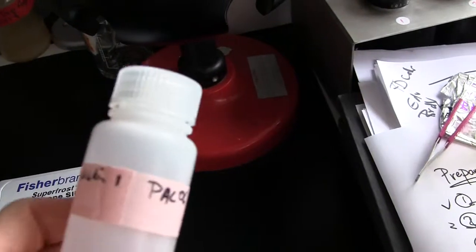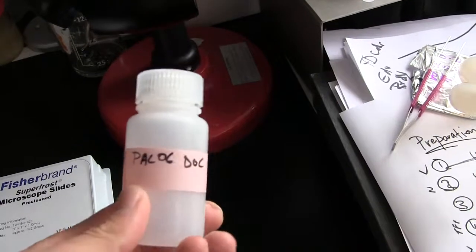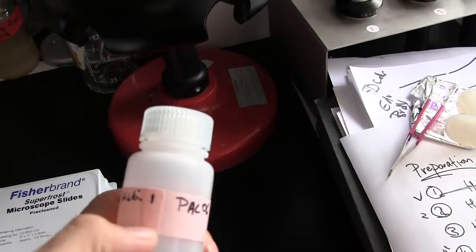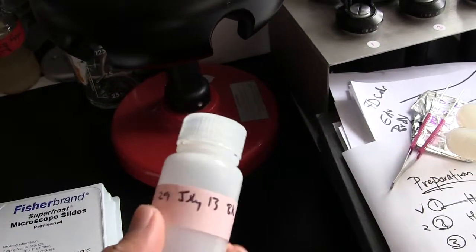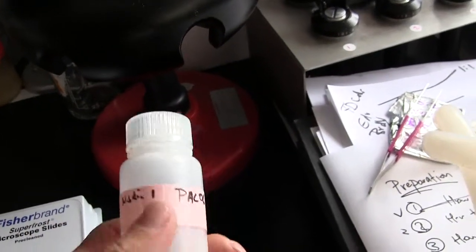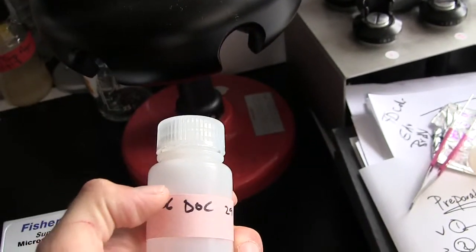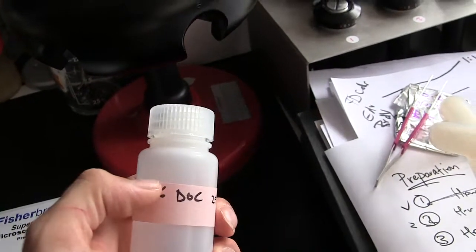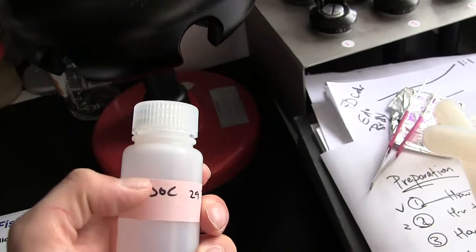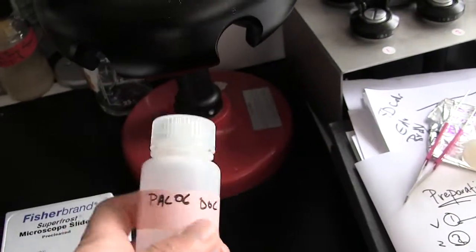Alright, so first of all, this is a DOC sample. It comes in a large wide mouth high density polyethylene HDPE bottle. You'll see that I've labeled it by placing lab tape all the way around it, so it comes back and loops onto itself, so it sticks on there. You don't have to worry about it coming off. When you fill this bottle, you fill it 2/3 full, which is why I've also put the tape about 2/3 of the way up, so that I know once I see water above this label, I'm done. It's a visual cue for me.